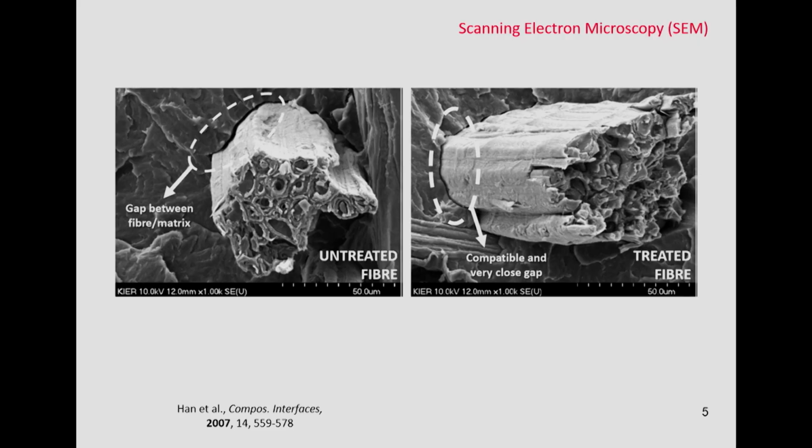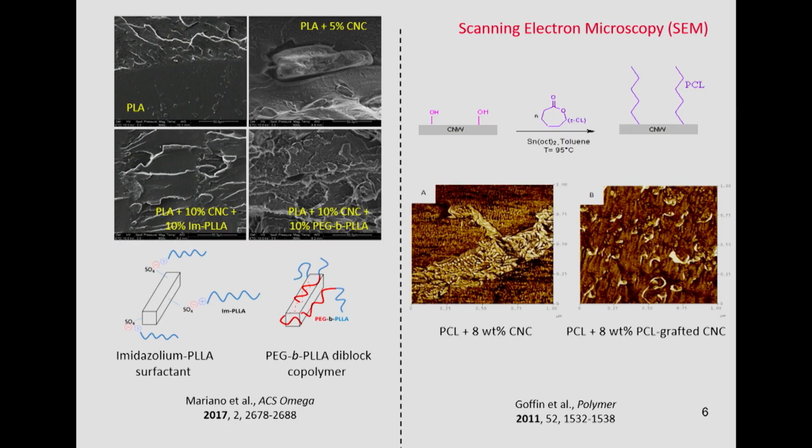So, these are some other examples. I don't remember which kind of fiber, but it's a natural fiber. I don't remember the matrix either, but what is important is, again, this gap at the interface and an improved compatibility or improved adhesion after treatment.